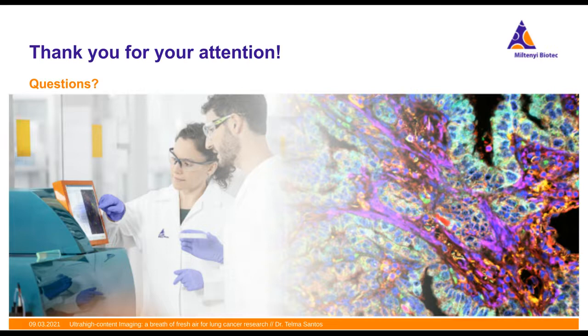Okay. Let's see. Is it only possible to look at ROIs rather than full tissue sections? So you define your ROI. It will depend on your choice. If you want to select the full section, you can, as long as it fits into our disposable. Our biggest disposable is the Maxwell one, and you can have most of the portion of your microscope slide there. But of course, you will have to consider that this will take more time because of all the image processing and also the experiment to be done. But it's possible, yes.